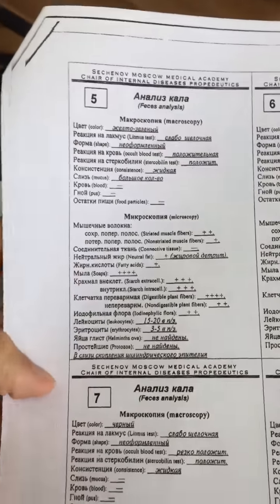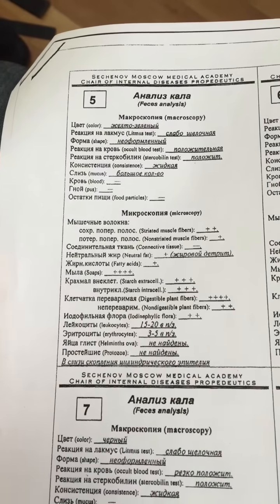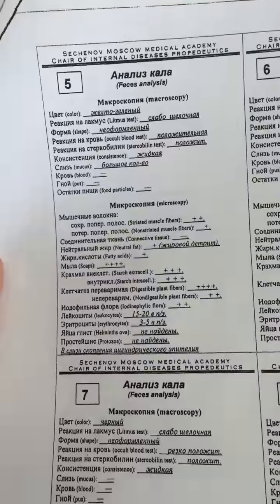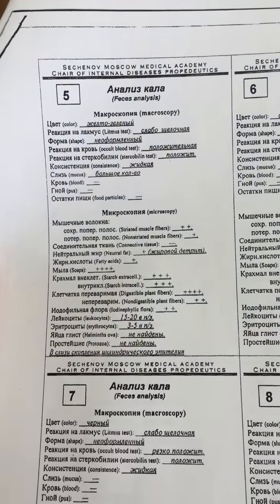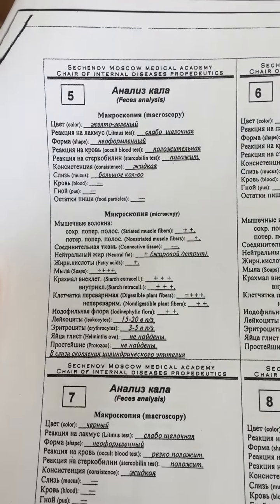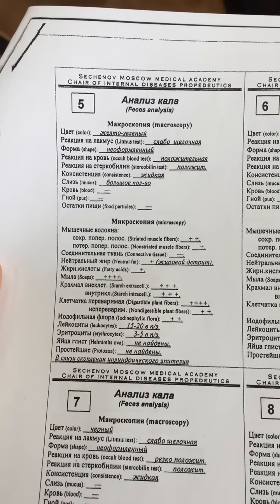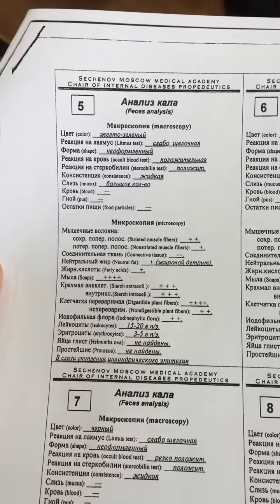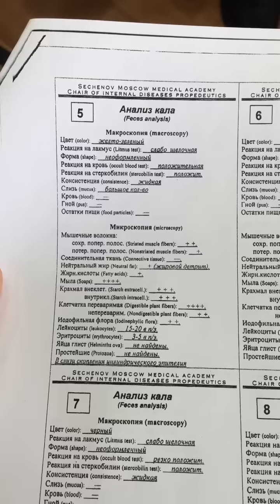Number 5. The color is yellow greenish. Yes. Litmus test slightly alkaline. The shape is fluid. Yes. Non-formed. Occult blood test positive. Stercobilin test positive. The consistency is fluid. The diarrhea. Okay. And a lot of mucus.